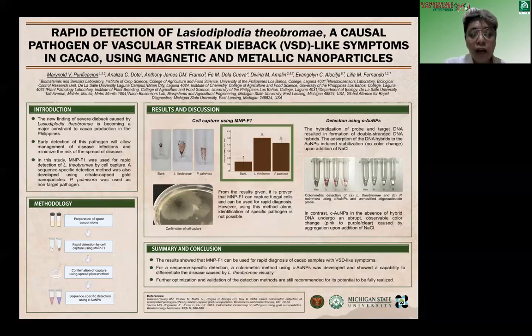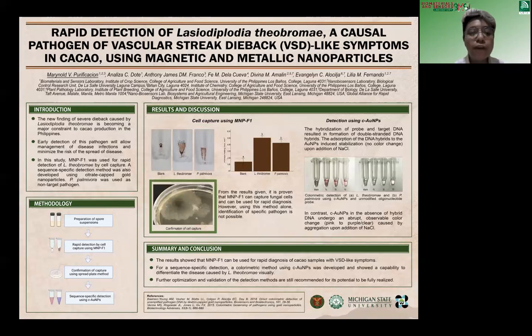The matting area of blank and samples were analyzed using one-way ANOVA and LSD test at alpha 0.05, or at 95% confidence level. Significant mean differences were observed between blank and samples. The MNP-zoospore complex and blank were also resuspended in phosphate buffer and spread plated onto HSPDA. The confirmation of capture was then determined after 3 days of incubation.